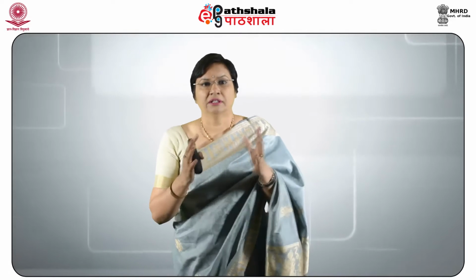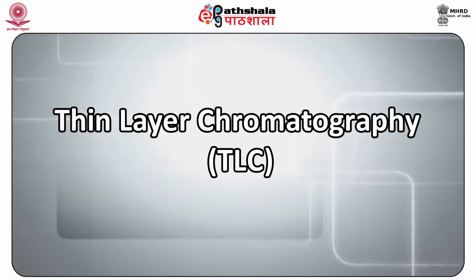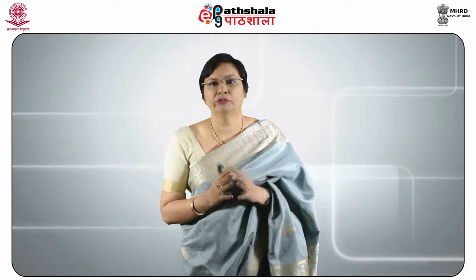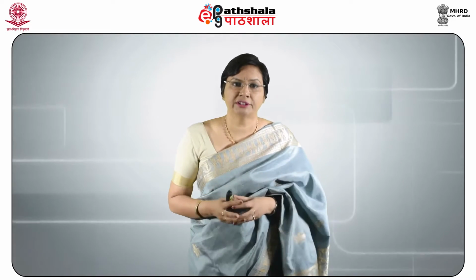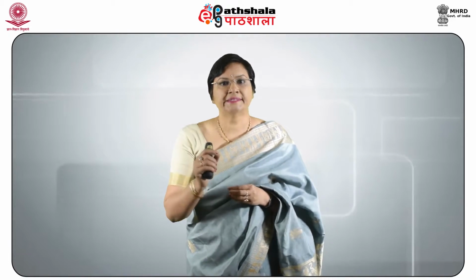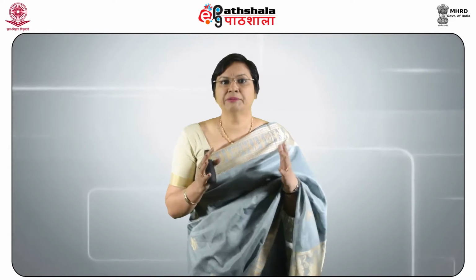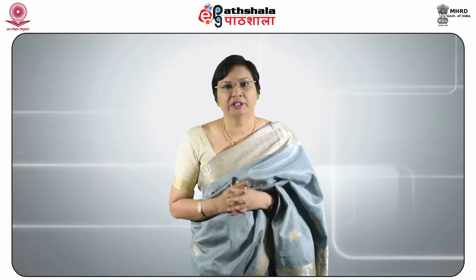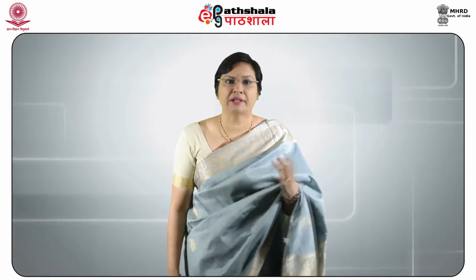After this, let us become familiar with TLC, which is thin layer chromatography. Thin layer chromatography is an invaluable method used in chemistry, biochemistry and forensic chemistry. Being economical and sensitive, this technique, which is simple to use, can be automated. It has become important essentially since it is possible to carry out several separations in parallel.